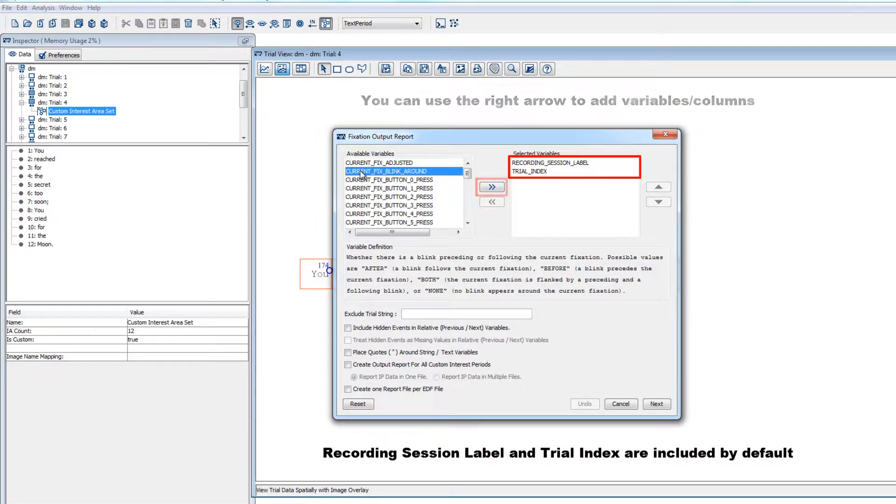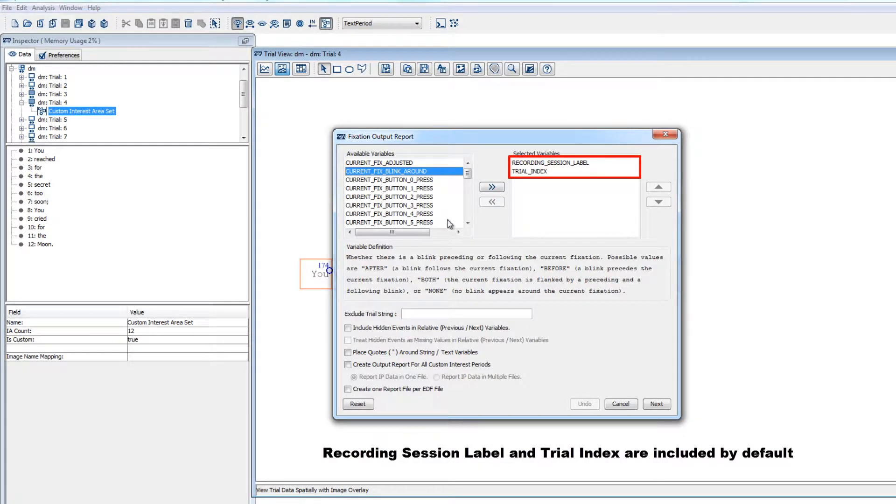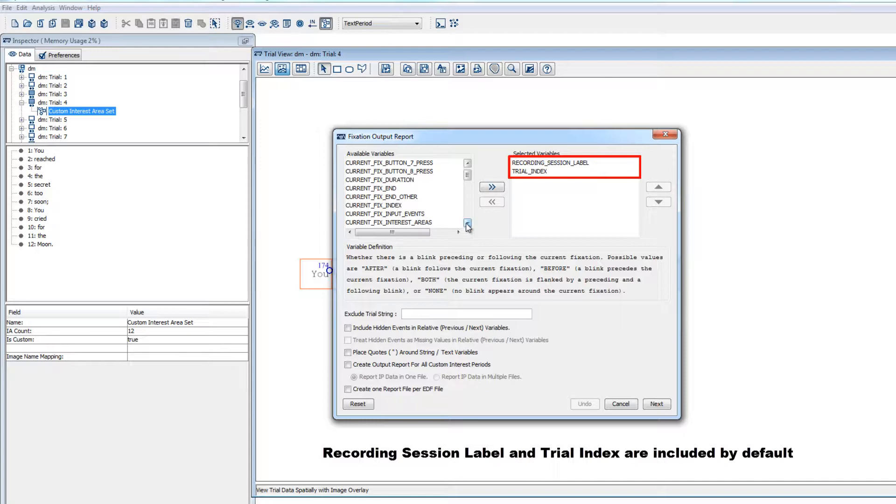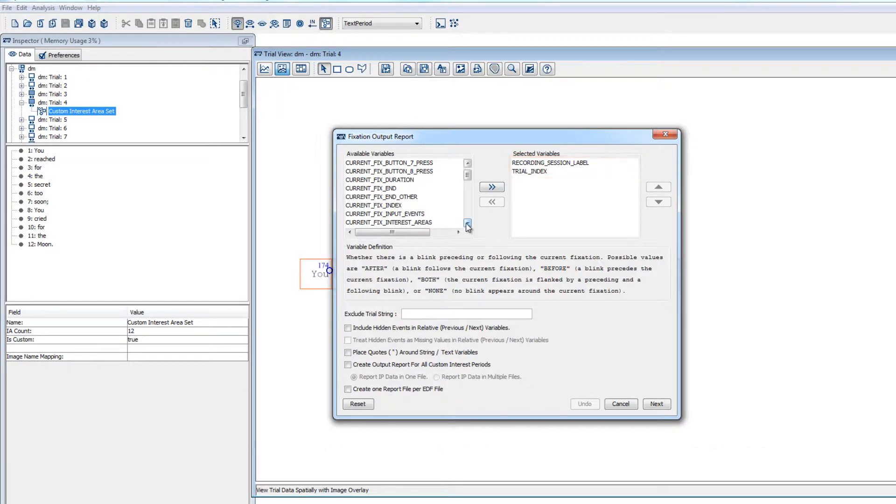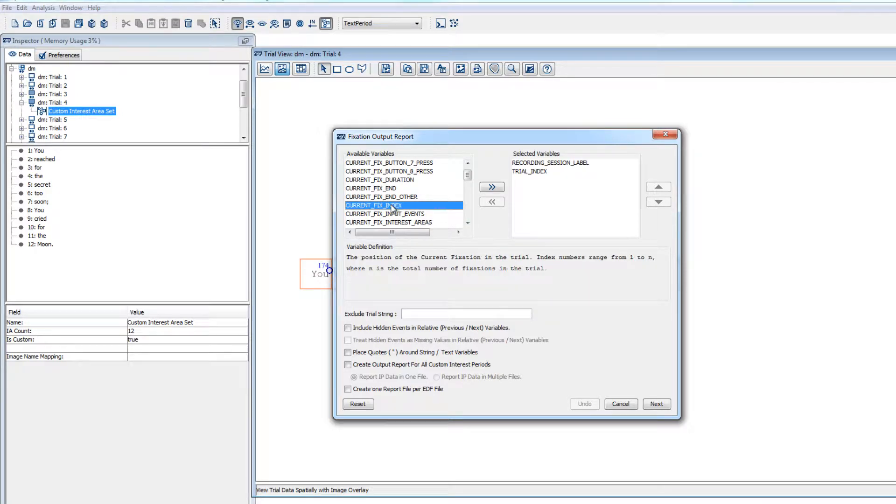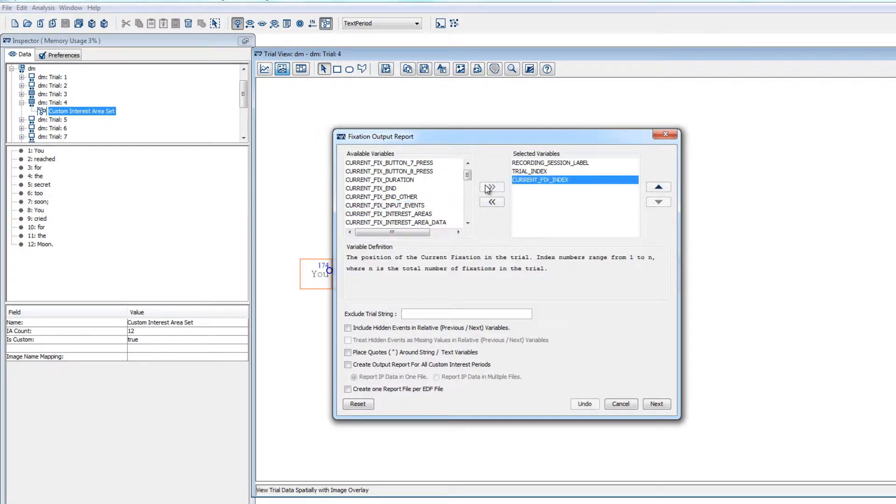Recording session label, which is the EDF file name, and trial index, which is the trial number for a given participant, will be included by default. For a fixation report, we might want to include current fix index, which will be the ordinal number of the fixation within the trial. In other words, one, two, three, for first, second, and third fixations of the trial.